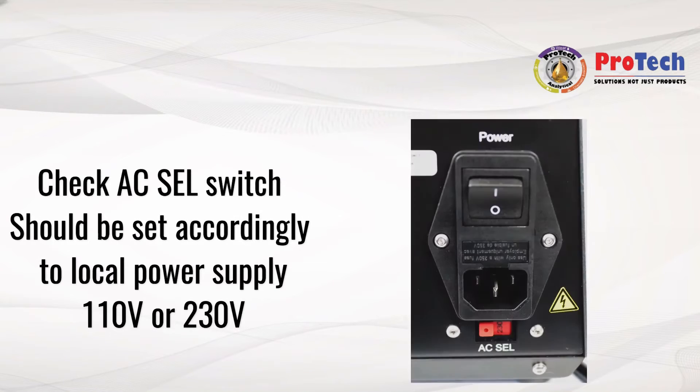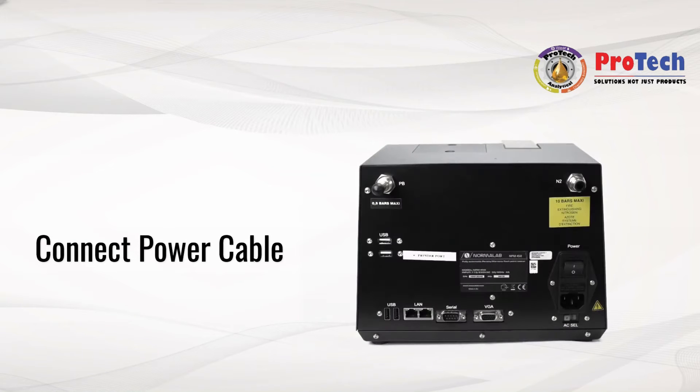For connecting your unit to the power supply, check the AC selection switch for the right voltage, then connect the power cable.